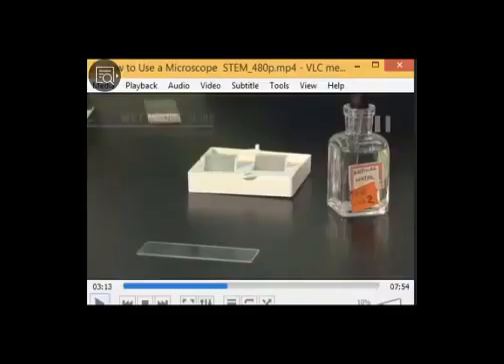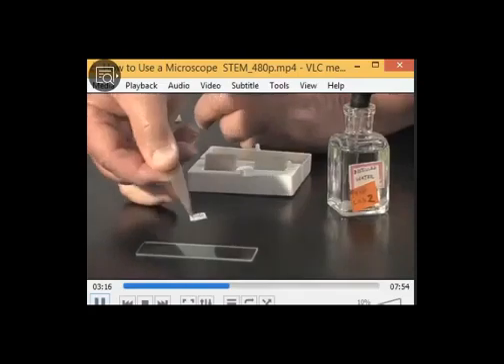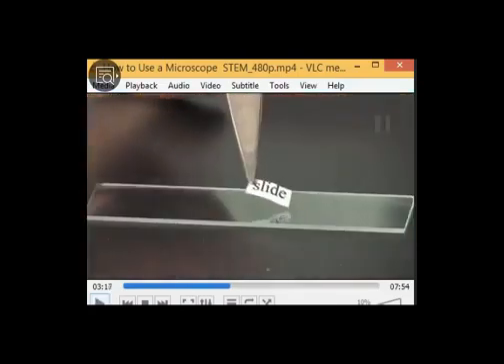Today's experiment is a wet mount experiment. For the wet mount experiment we need a glass slide. We need a cover slip. You can see the cover slip also, and you can see distilled water, moya, because this is aina bil moya. Okay, so how? First of all, you take the slide, then you put a specimen upon the slide. Here you can see this specimen is actually a paper, waraka, sagir.